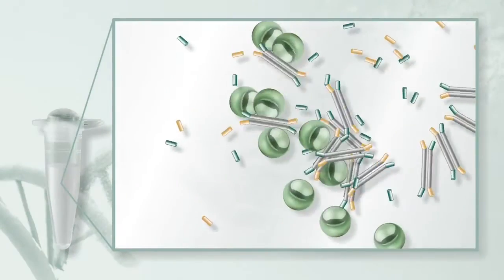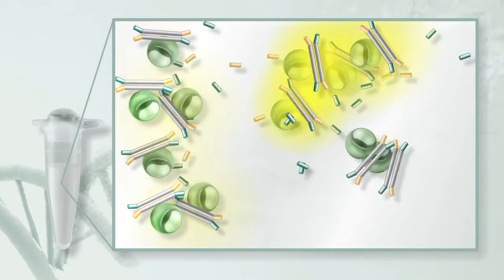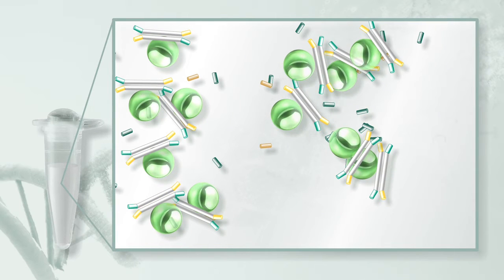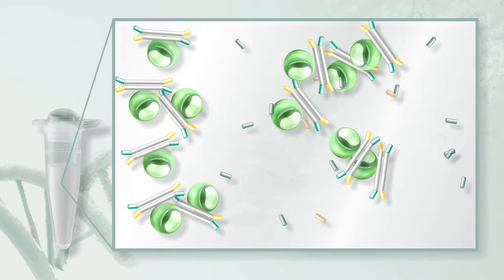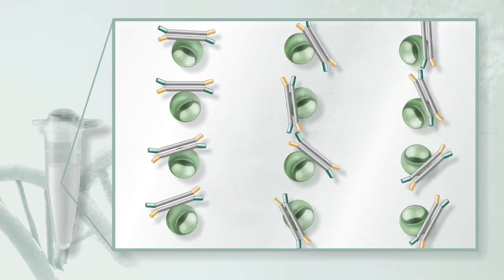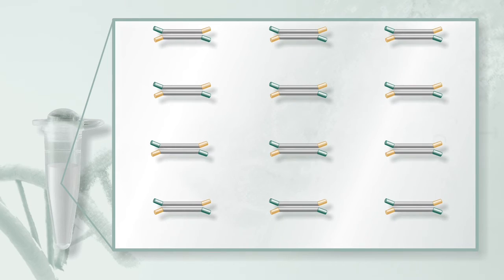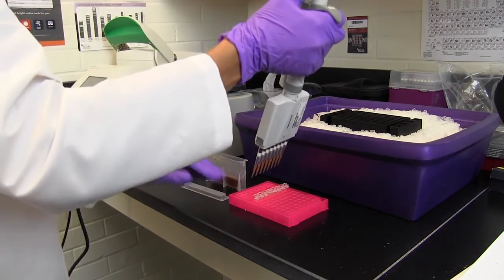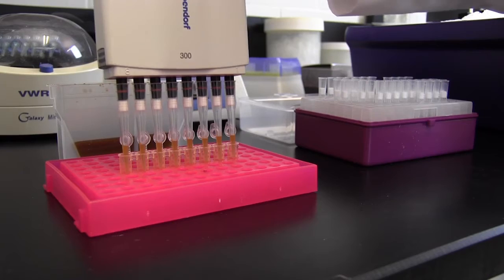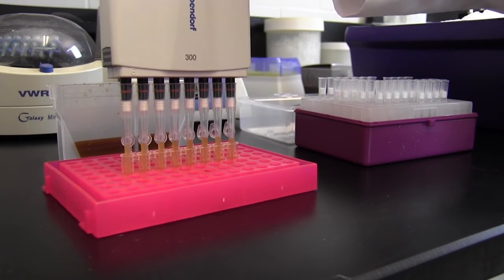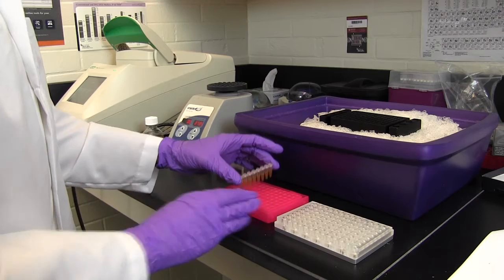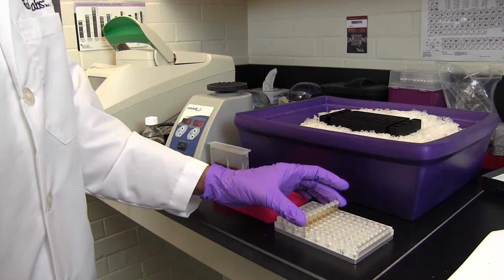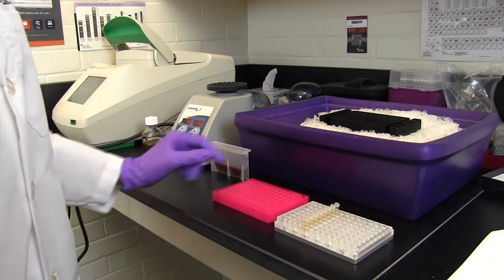This step also uses magnetic beads but this time there is a single step after which the desired DNA, the library, is bound to the beads. Don't discard the beads. Add 45 microliters of vortexed magnetic beads to the reaction and mix well by pipetting up and down at least 10 times. Incubate at room temperature for 5 minutes followed by exposure to a magnetic field.